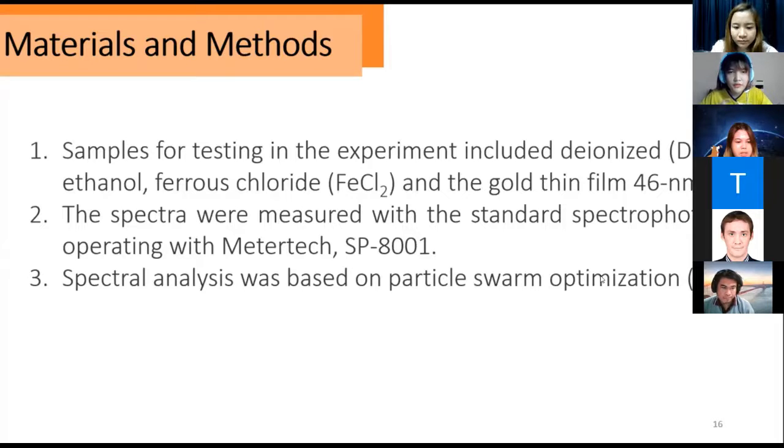We use DI water, ethanol, ferrous chloride, and gold film. In another step, we measure the spectrum of the sample with the standard spectrophotometer, and give the signal to analysis based on particle swarm.